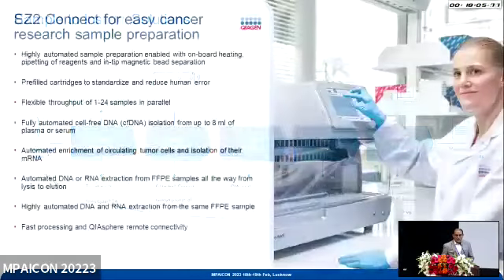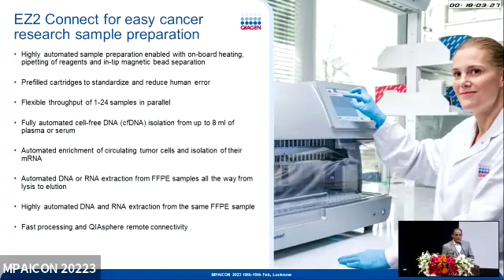So in this workflow, a recent thing which we have introduced is one platform. Currently we are having a lot of challenges when we do DNA extraction from FFPE samples as well as from liquid biopsy samples. So this is something which we have put in. It's a fully automated platform where it isolates DNA as well as RNA from FFPE samples without any manual steps. There are a lot of manual steps when we work with FFPE samples, and DNA is also very compromised with this.